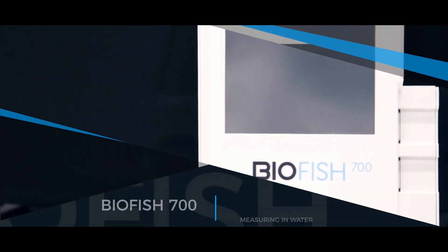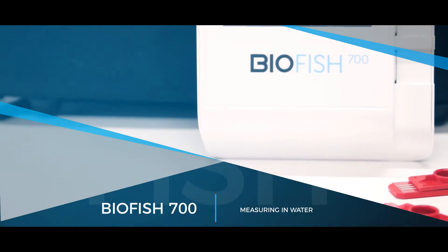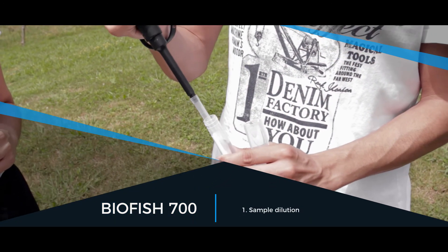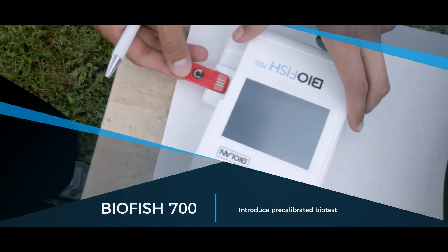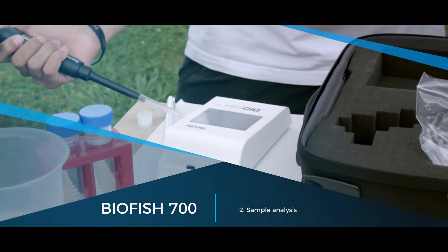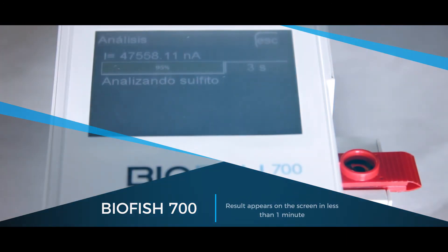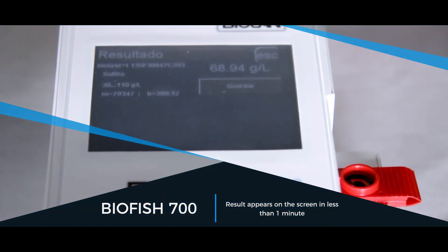For sulfite analysis in water, two simple steps need to be performed: sample dilution, and introduce the pre-calibrated biotest for sample analysis. The result appears on the screen in less than one minute, expressed in sulfite concentration units.